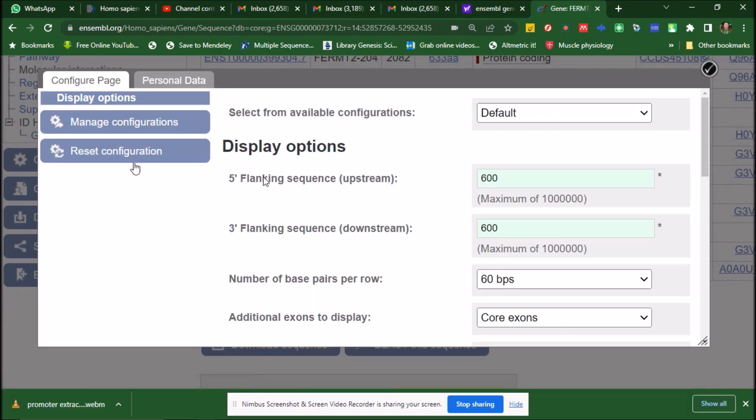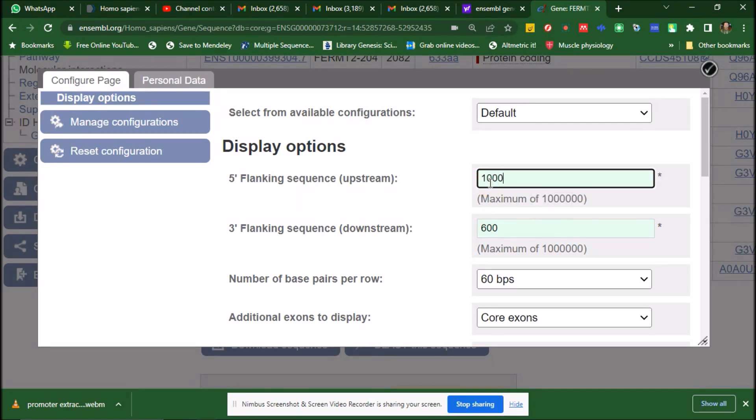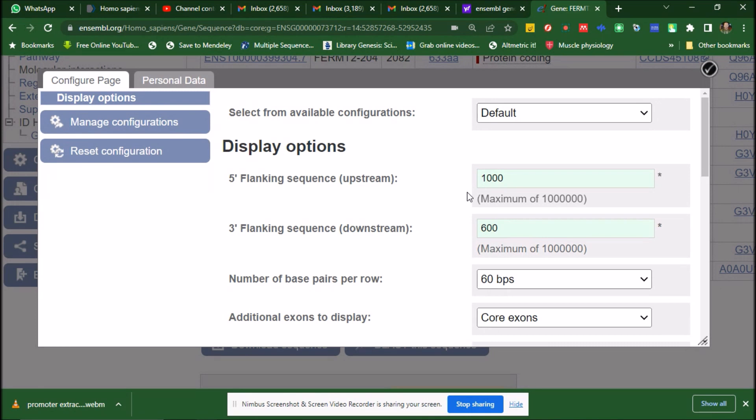In the 5 prime flanking sequence, instead of 600 base pairs, we will give it to 1000. The reason is that the promoter sequence is almost 1000 to 1200 base pairs, out of which 1000 base pairs is the part that is upstream of the 5 prime end of a gene. So that is why we put it 1000 base pairs. We select 1000 base pairs.